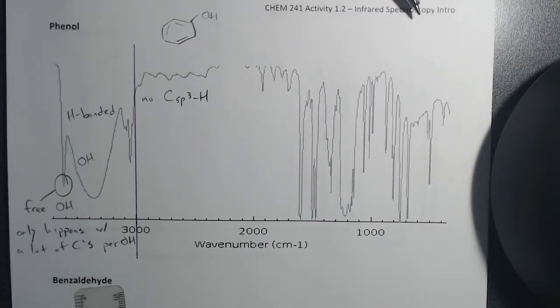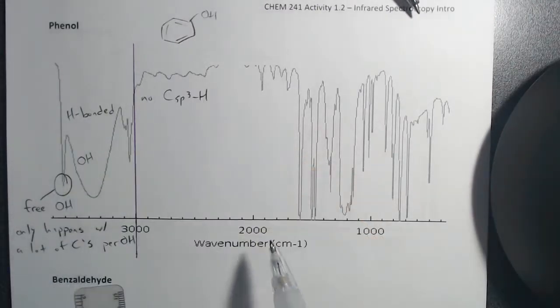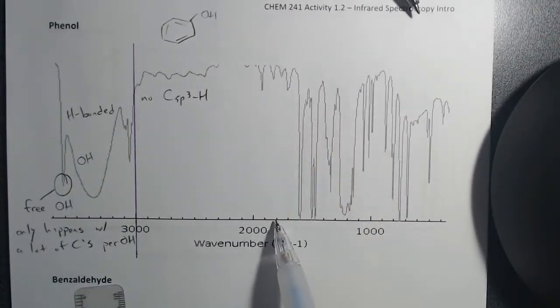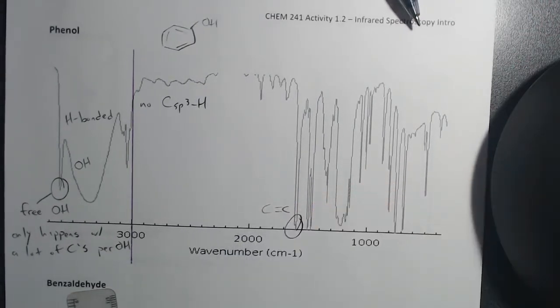We do have ways to see aromatic rings. And I just want to mention here that this method for viewing aromatic rings is not 100% reliable. So one thing that is reliable is we can pick out the double bond C. So we have 19, 18, 17, 16. So this right here. So that is our CC.